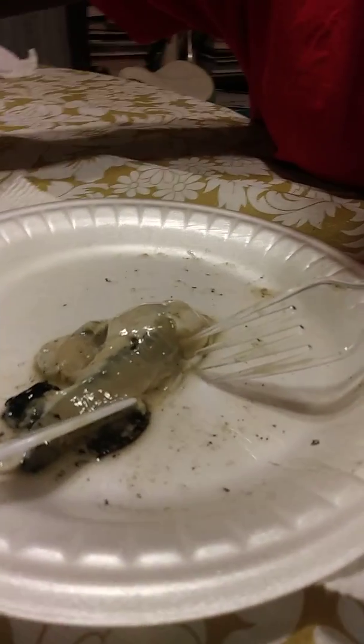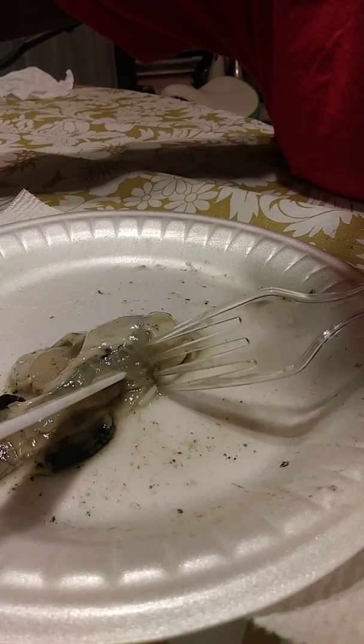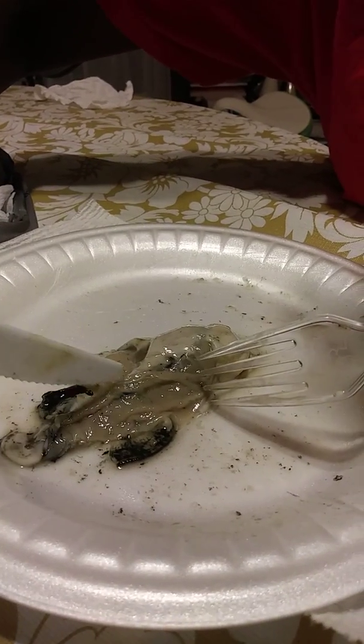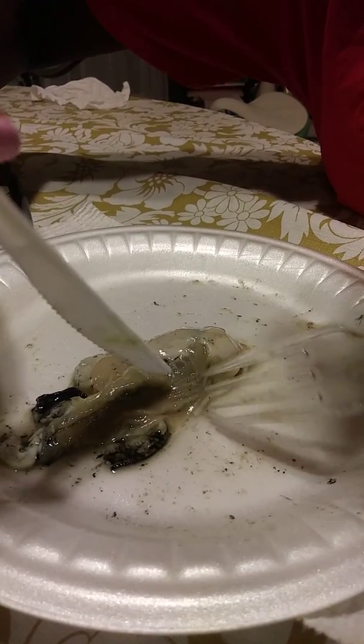They have gills like fish, and that's how they breathe. There are 4 of them. Gill number 1 is here. I'm going to move them to the side so we can see the different gills. That's gill number 1.